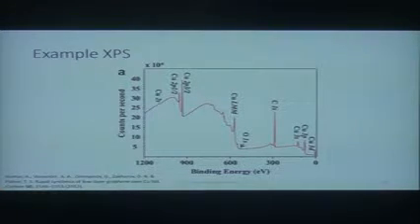So I have these copper peaks here at about 900 electron volts of binding energy. And so you know where those are in that catalog that I talked about. In that recipe book of, okay, so copper has a peak, the 2p peaks are here, and you just know that, and you say, okay, that's my reference point. Now then, these other things you're not so sure about because it's what we grew. So you have, in our case, the 1s peak of carbon is known, and we see it there.